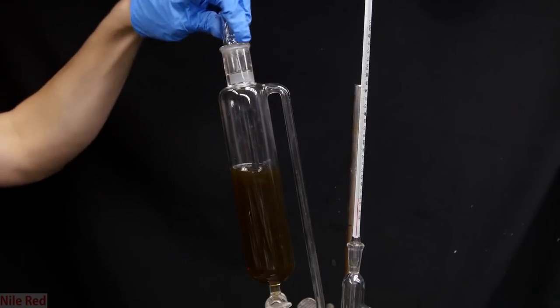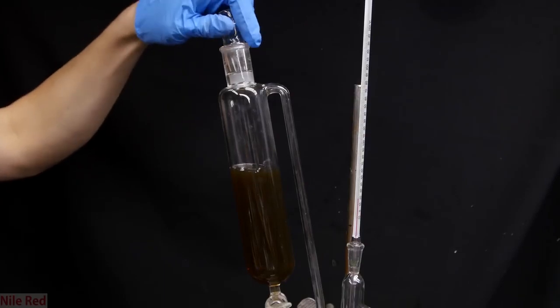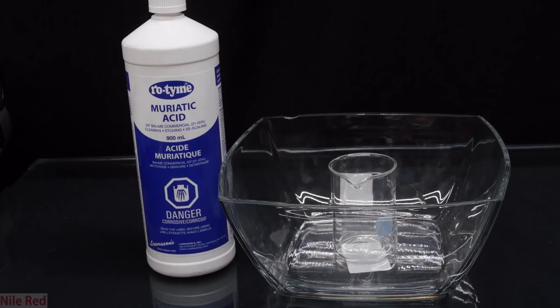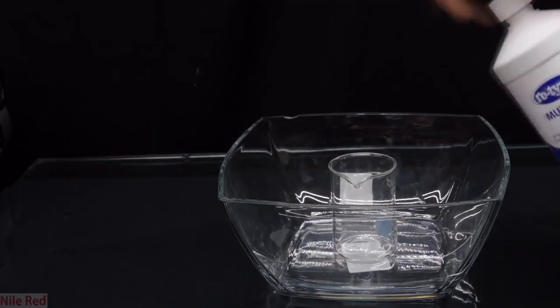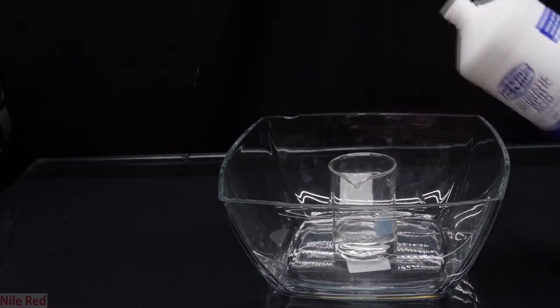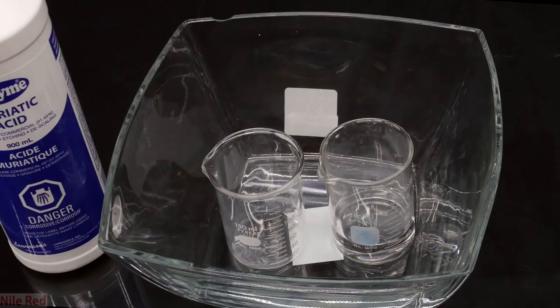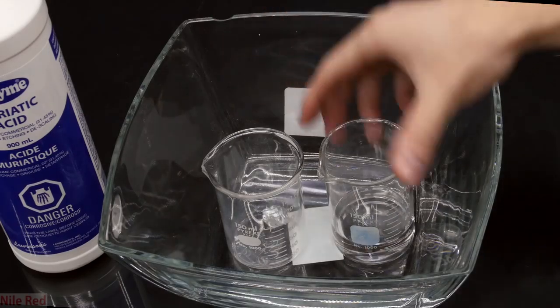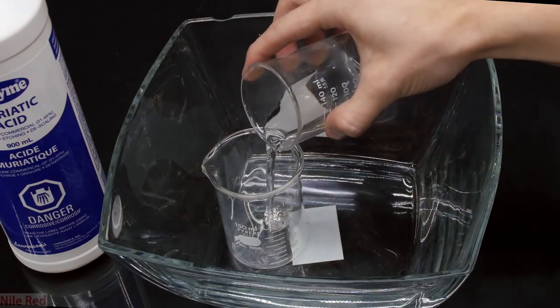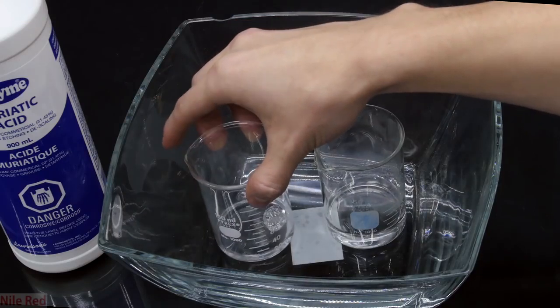So with that being said, I'm going to get started, and we'll start with muriatic acid, also known as hydrochloric acid. So here we have some 31.45% hydrochloric acid that I bought from the store. To start off, I pour a little bit into a beaker. I add another beaker and I place some aluminum foil inside, and then on top of this I pour in some of the acid. I did this for two main reasons.